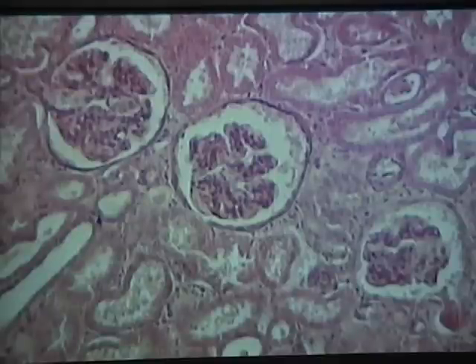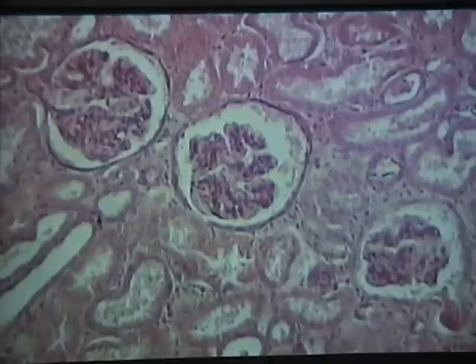Epithelial tissue slide. This slide comes from the kidney. In the kidney we have renal corpuscles and renal tubules. That allows us to recognize the organ as the kidney.